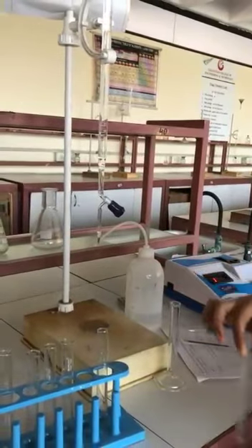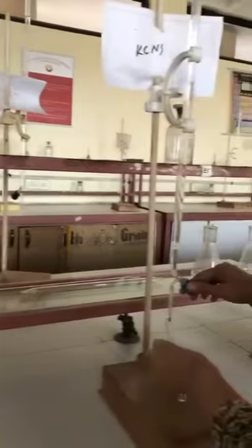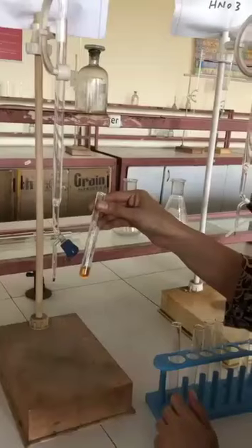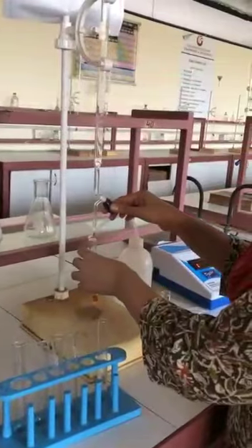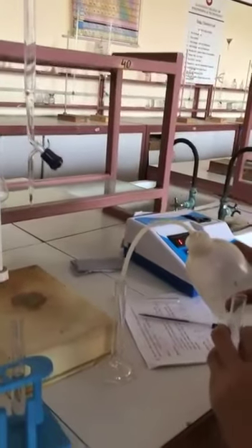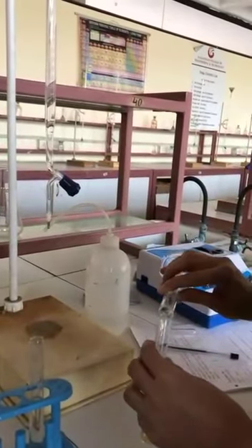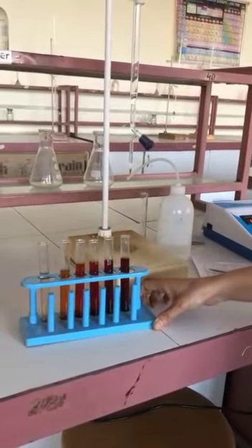In the second test tube, we have to add 0.5 ml iron 3, 0.5 ml KCNS. Now, KCNS is a color developing agent, that's why the solution becomes colored. Now, we have to add 1 ml HNO3 and the rest 8 ml distilled water. In the same way, you have to prepare 6 test tubes.